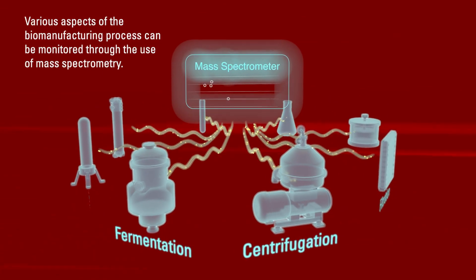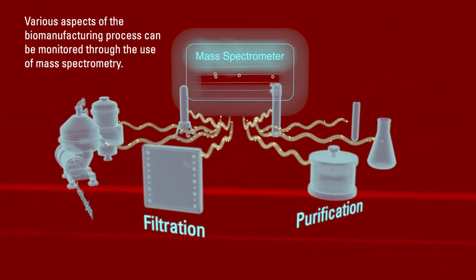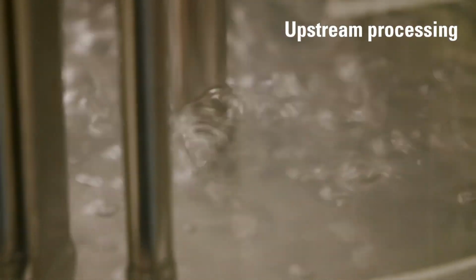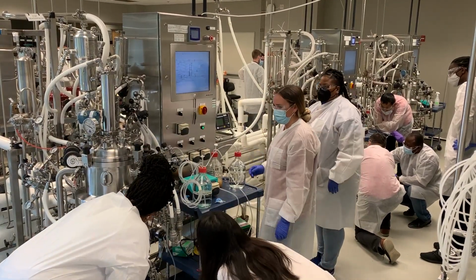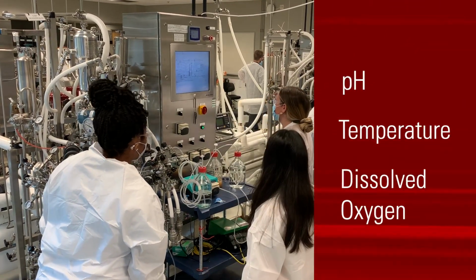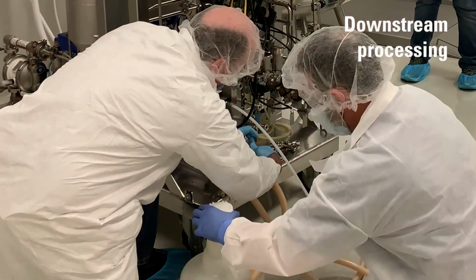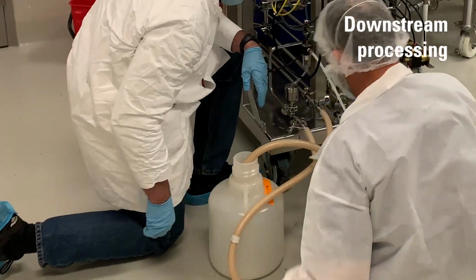diversity in the end products that is undesirable but realistically difficult to prevent, simply because of the inherent biomanufacturing process. For example, upstream processing involves culturing of cells in bioreactors that are at set controlled conditions. So any changes in that physiochemical environment, such as pH, temperature, dissolved oxygen, and such, can negatively affect the quality attributes of the product. Downstream processing, on the other hand, can also be a source for heterogeneity in the product.